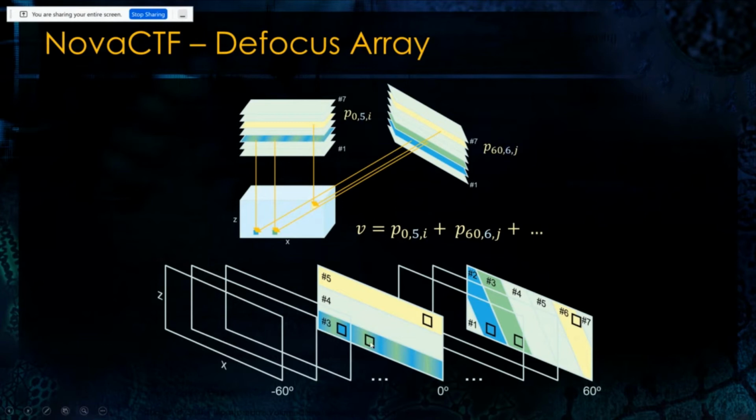And here the same for the green: it would be the same one for the 0 tilt degree, but a different one for the 60 degrees. So this is just one lookup table, so to speak, to fetch the correct index. Then we can simply take the value from the already corrected image, which makes this implementation very efficient and not so time consuming.